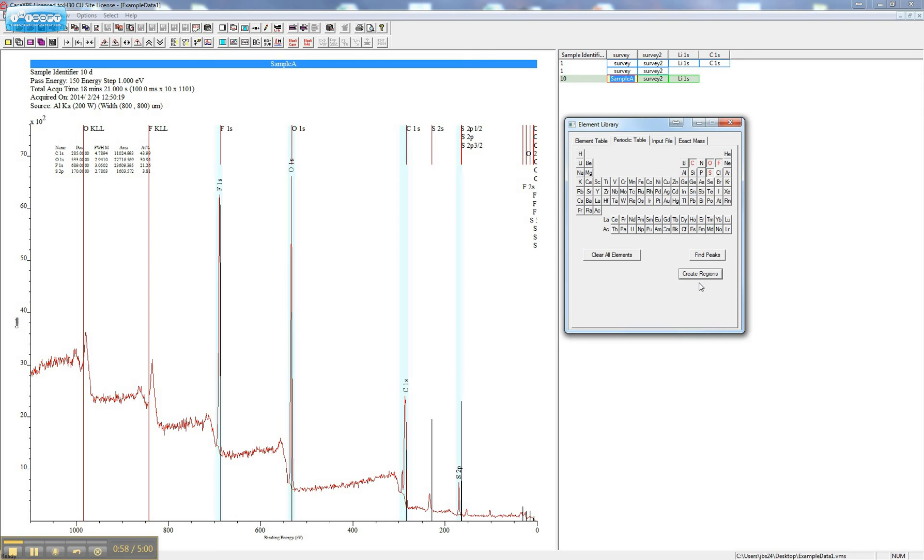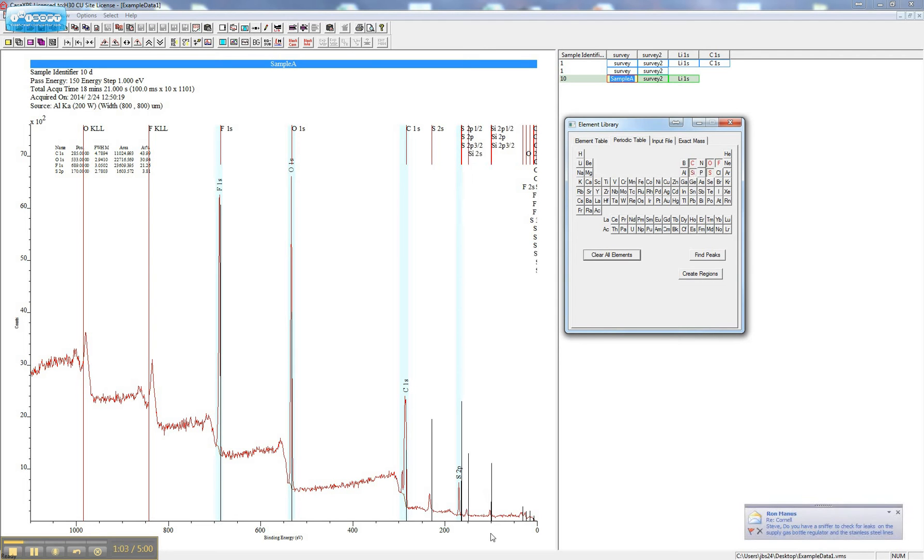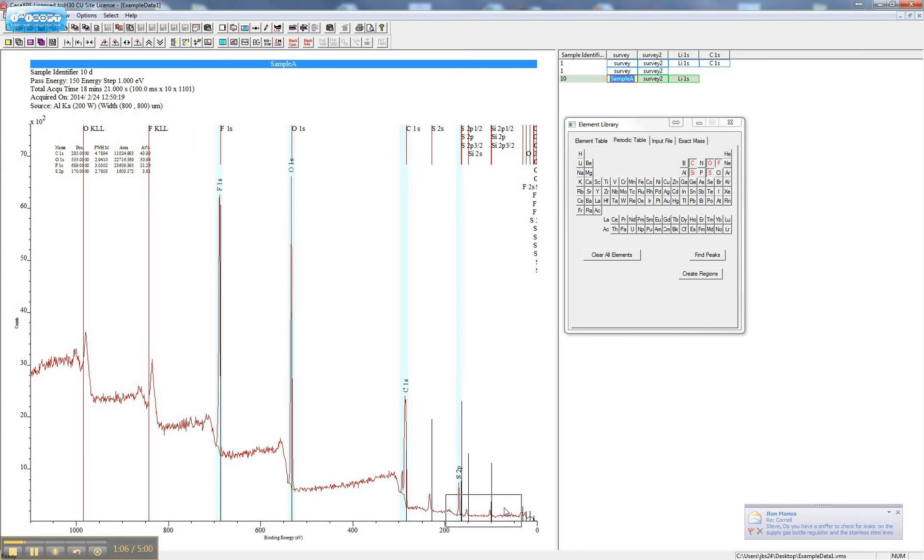If you or CASA miss an element, in this case for silicon, just zoom in on the area by creating a box and clicking on it.